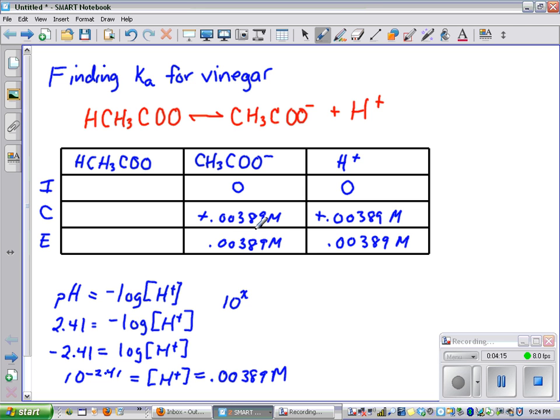But that's not the whole answer. We need to find out how much vinegar we had to start off with. And in order to do that, we're going to titrate the solution.